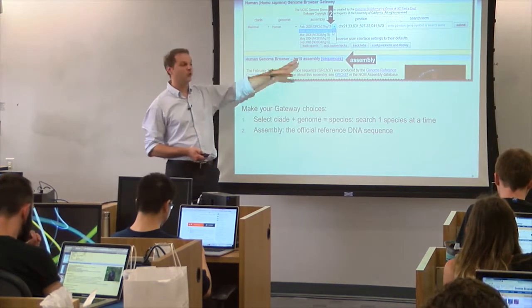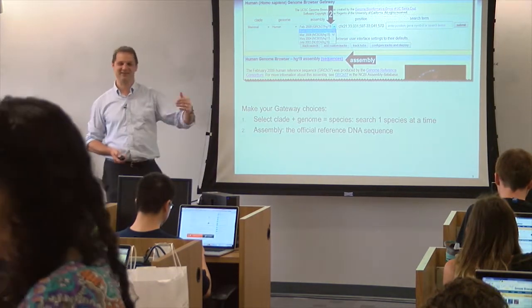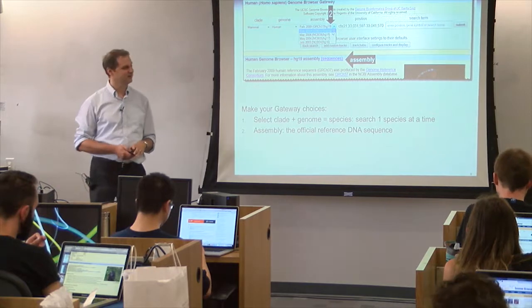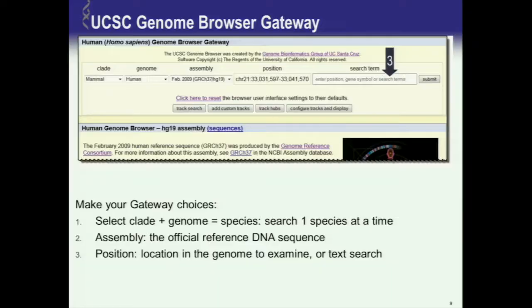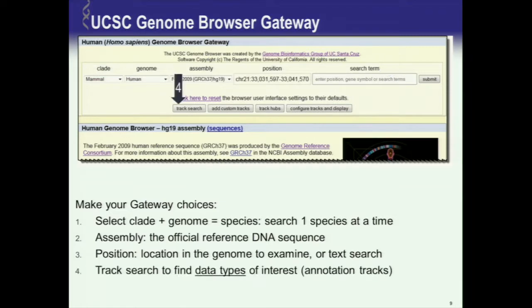But always know what build of the genome you're working in. If you ever get data from anywhere else, always know what build it is, because everybody makes that mistake. And once you've done it once or twice, you remember to check. But I still do it. And over here is our search box, where you type in whatever you want.